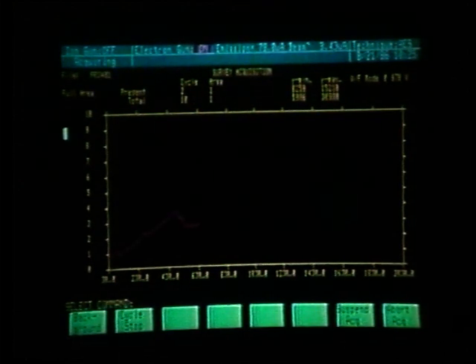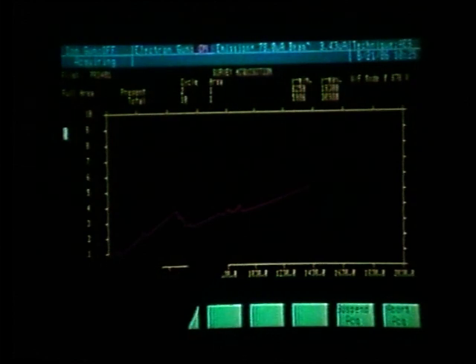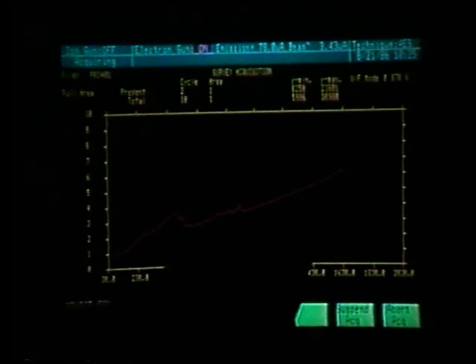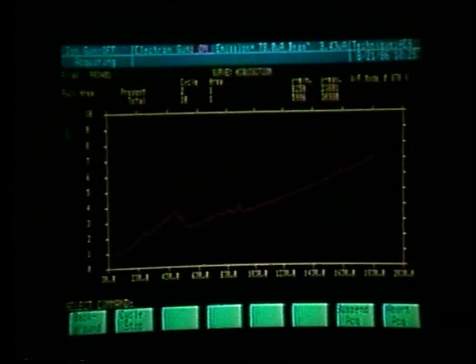From the N of E spectra, we see that this looks very similar to our first area in that we do have some silicon on the surface. We see the low energy silicon peak here. We also have more copper on the surface than we had on the previous area. And here we see the high energy silicon peak, which we did not see on area 2.